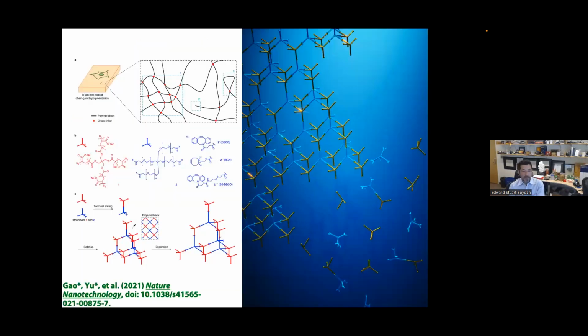So in summary, I told you that we have built expansion protocols, and many other people have been improving them alongside with us, improving expansion factor, optimizing it for different tissue types and sample types. And a couple of things have become very clear. Number one, it allows ordinary microscopes to become nanoimaging devices. And there have been hundreds and hundreds of published studies, either in preprint form or in peer-reviewed form, where people have used that aspect to do nanoimaging with equipment they already have access to.